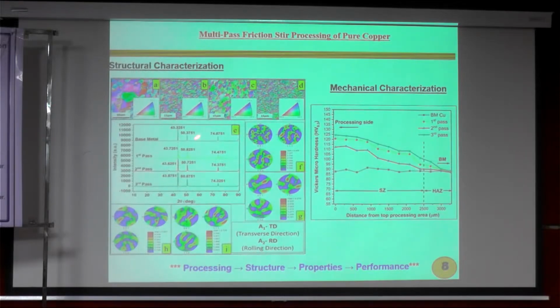This is the pattern we have taken from the electron backscatter diffraction technique. That is called EBSD. There they collect the signals of backscattered electrons. As we have already discussed, the electron-particle interaction produces various signals. Here the detector collects the backscattered electrons, and from there that kind of image is formed.